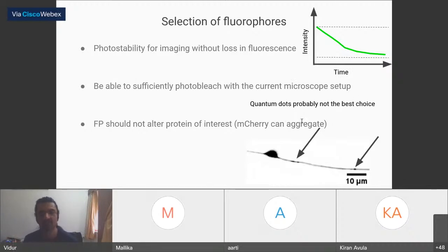Okay. So the second question is, I was unable to achieve 80% bleaching for GFP tagged protein. Is it something to do with bleaching parameters? Okay, so this depends on your experiment of choice and your system of choice. If you're using, let's say, HeLa cells, you will have to decrease the transfection amount so that your GFP overexpression is lower, so that you can come up to that 80% threshold.